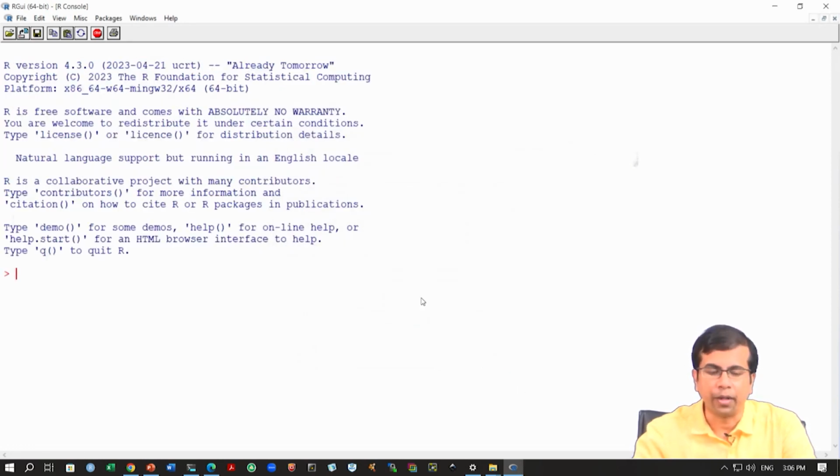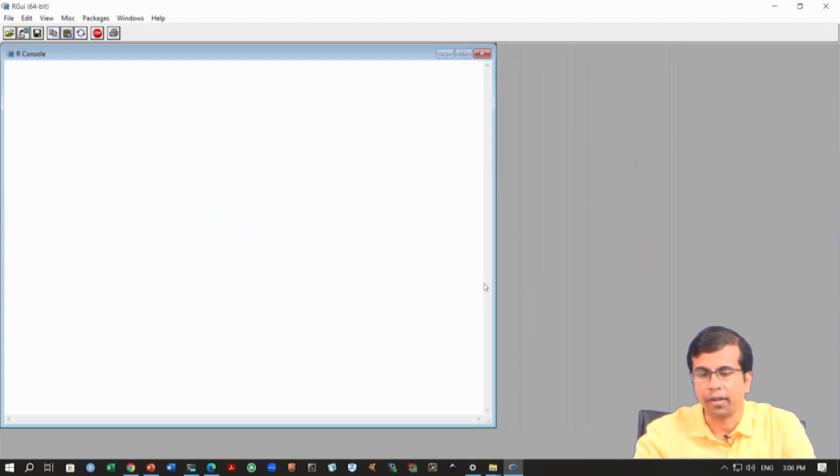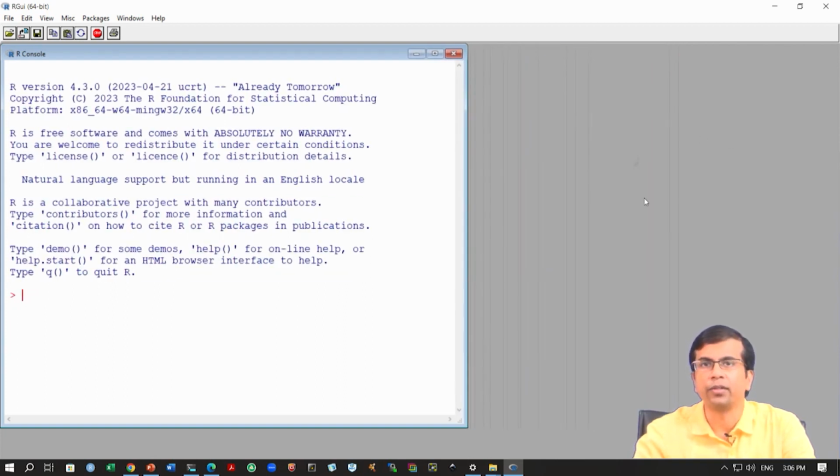Okay. So, this is bigger now. Okay. So, once I run the codes from here, the plots will also be generated side by side. Okay. So, I can see the plots in this part. So, that will be very useful, right. So, I can see and change the plots and the outcomes that I see if I want to.